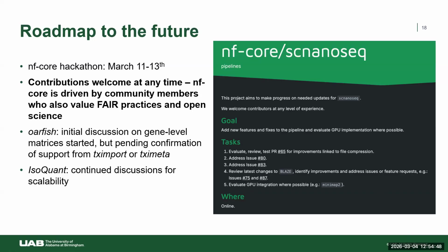Now, not every single tool that we use is GPU enabled, but some are, like Minimap. And Nextflow last year, I want to say, or Seqera, which is the company that maintains Nextflow, worked very closely with NVIDIA to ensure that GPUs could now be implemented in Nextflow workflows. So if NVIDIA joins us, we're going to make that a priority. If NVIDIA does not join us, we're going to make everything else here a priority, although we would still want to look into GPUs in the near future as well.